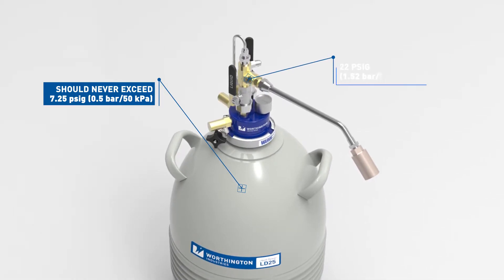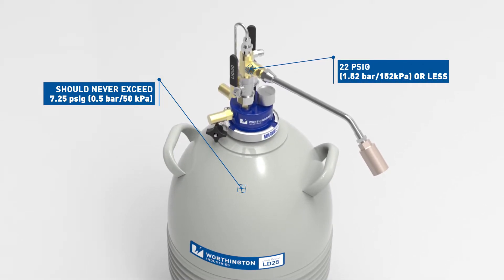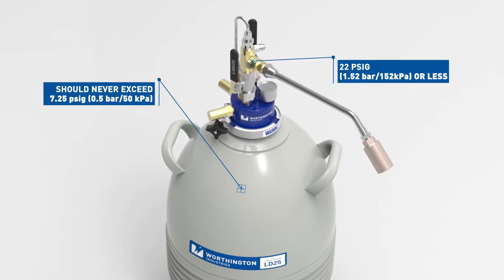Fill the Dewar from a supply source at 22 PSIG, 1.52 bar, or 152 kPa or less. Do not pressurize using compressed air.